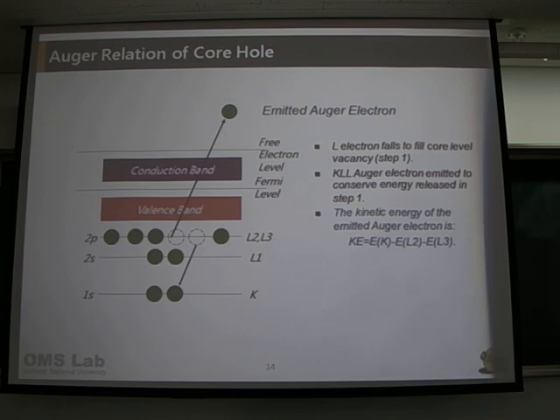But what Abu just said is that the tail is not that important. We don't do quantitative analysis, but for the whole spectrum, the shape is quite important because it gives information about the different atoms, like whether it's ammonium, whether it's amine, or sp3. The overall shape gives us that information. But from this tail, the Auger electron, we don't get quantitative information. Understood? Yes. Okay, go ahead.